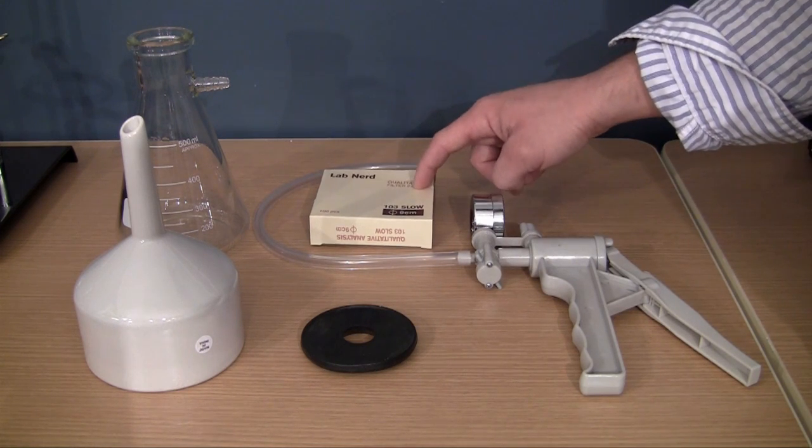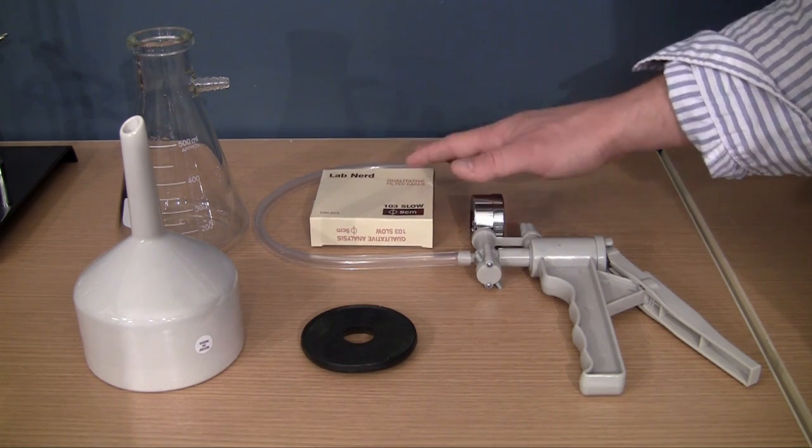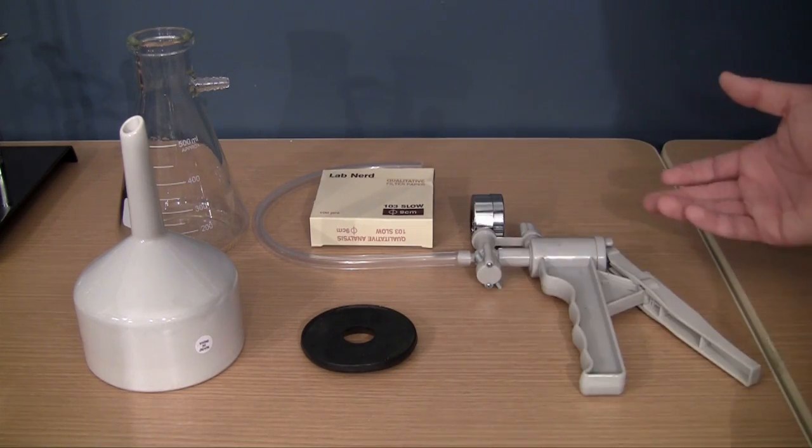And the last thing you need is filter paper. Now this is kind of like a coffee filter, but smaller and more scientific, of course.